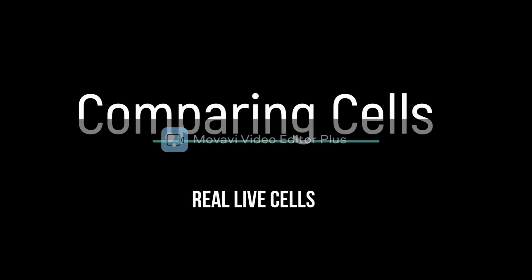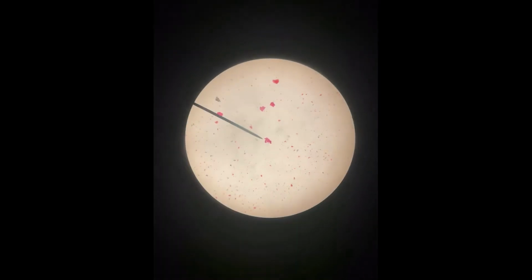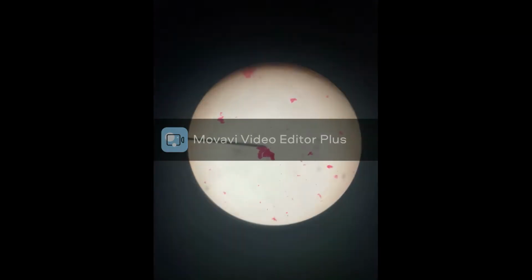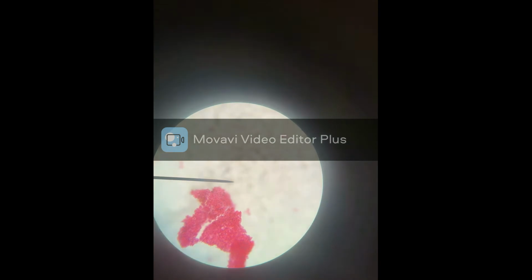Alright folks, so this is a video where we're going to be comparing some cells. You're going to see a bunch of different versions at different zooms, and so we're going to start off with some bacteria cells called Helicobacter pylori. We can see zoomed out what that looks like and a little bit closer in. And we're going to zoom all the way in and see what that looks like all the way in.